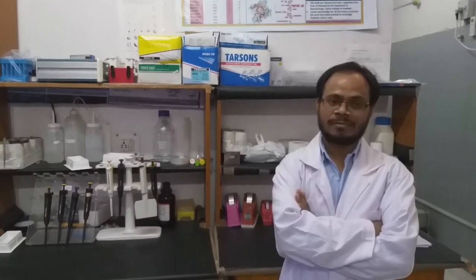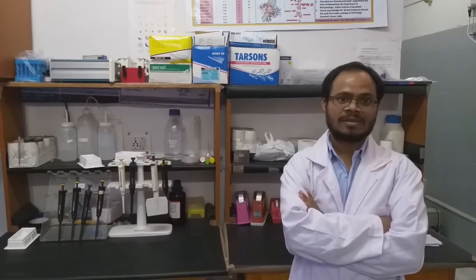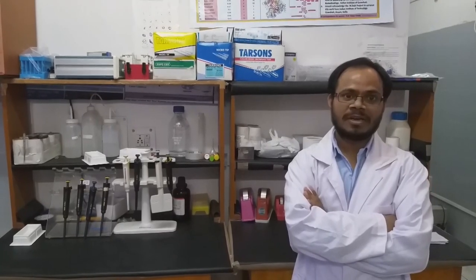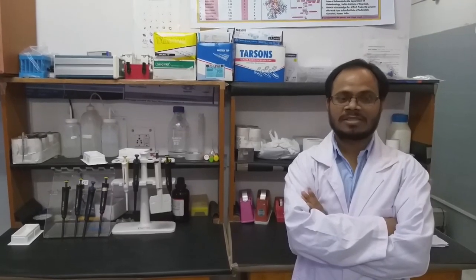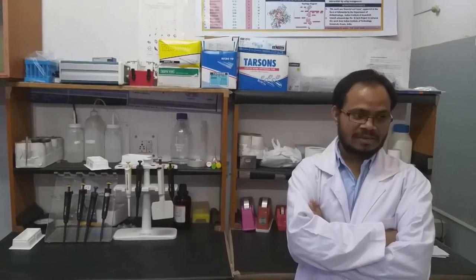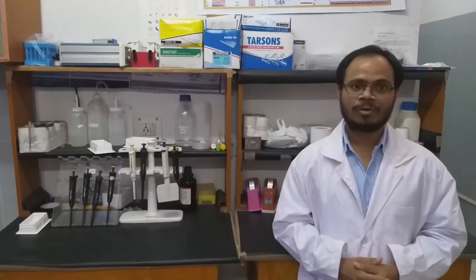To conclude the video demonstration, we have discussed how to prepare bacterial culture media, how to prepare cotton plugs and autoclave it. While weighing the media, we have to make sure that the media components are not exposed to air, because those substances absorb moisture and become liquefied. Another thing is that for cotton plug preparation, we have to take a single layer of cotton and then fold it.